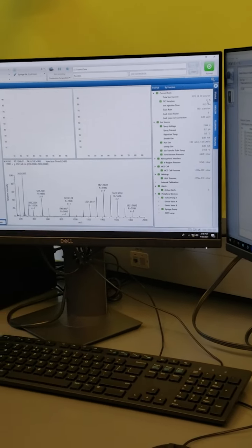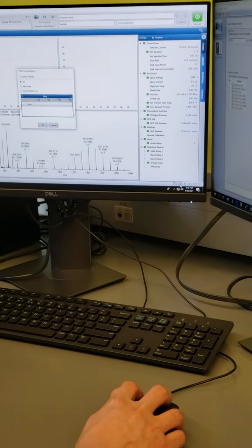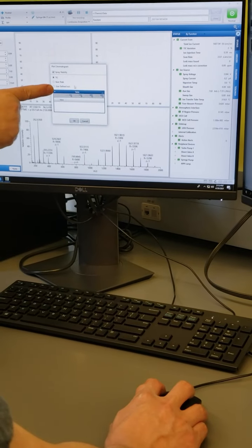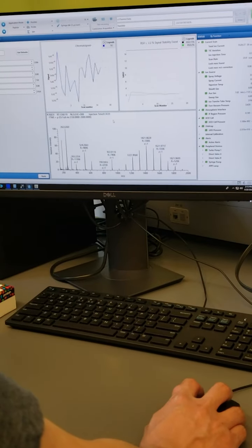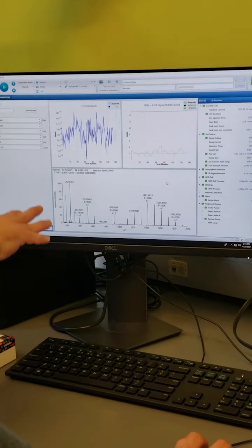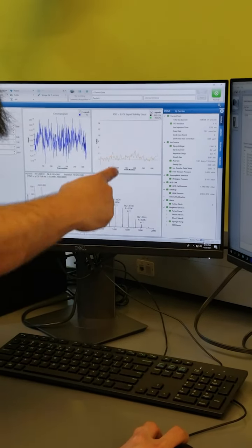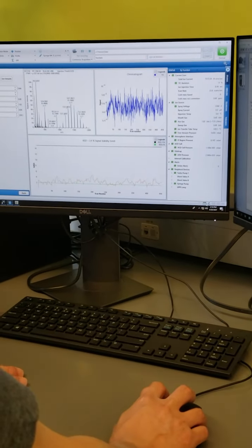The technical way to do it is if you go down here to this little peaks plot chromatogram, click there and click spray stability, and you can do either total ion chromatogram, the base peak, or you could user define a specific mass. Let's do the TIC and click OK. So now it's going to scan, look at the TIC and plot that same thing right here. And there's a little circle here. You can rotate these to make them look however you want. We've made it very customizable if people want to look at it a certain way.